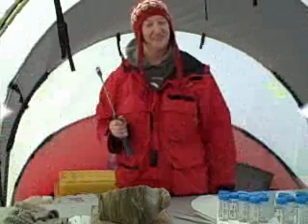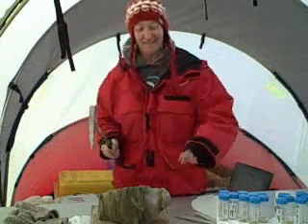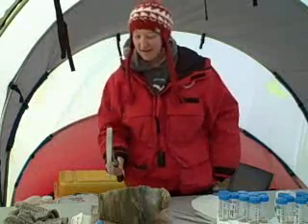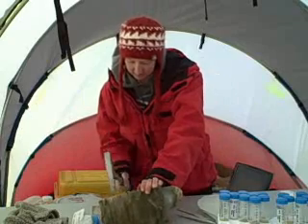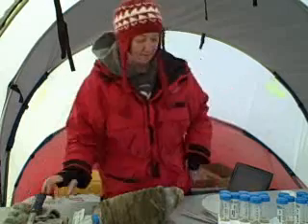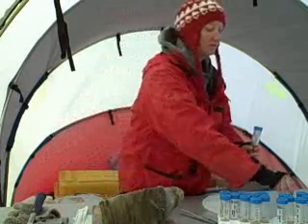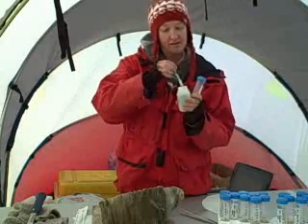So the first sample that we're going to put into media is going to be our dirty ice. Obviously, I can't fit this whole thing into my tube, so I'm going to have to break off a couple pieces. Alright, I got a couple of good pieces that look like they have the same amount of sediment in them, so I'm now going to put them into my test tubes. Before I do that, I'm going to dip my forceps into ethanol.